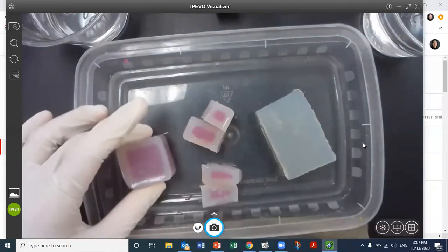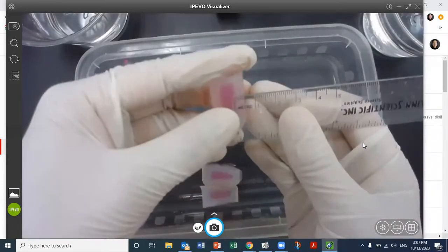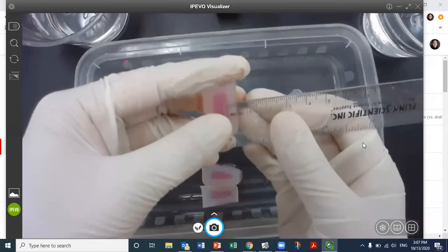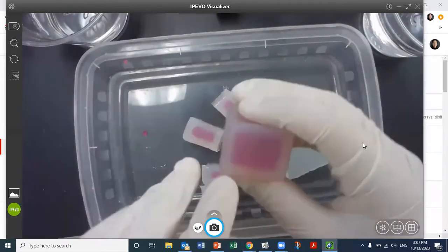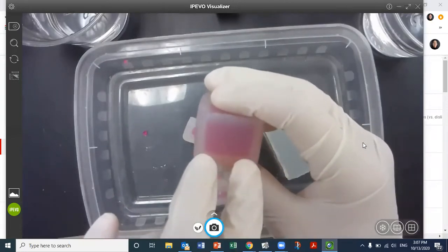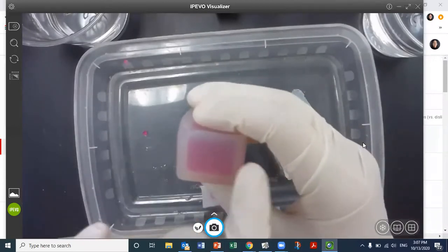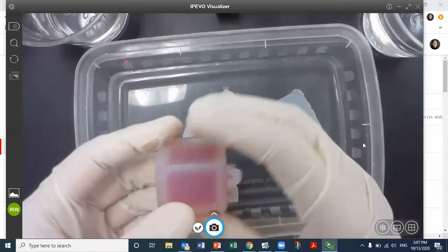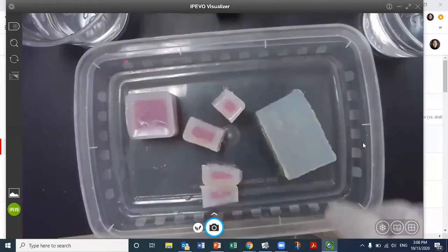Okay. So for all three tables now, you're going to be able to mark that the diffusion depth is 5 millimeters. And that means that when you are calculating the width, base, and height of the pink inside now, you're going to be taking off 5 from both ends, which means you're subtracting 10 millimeters from each of their measurements.